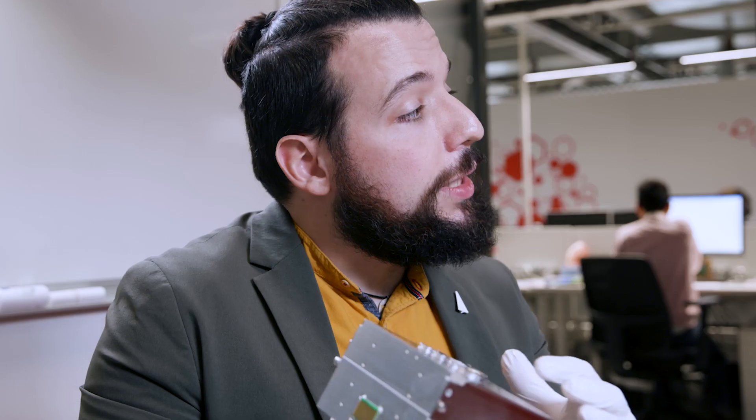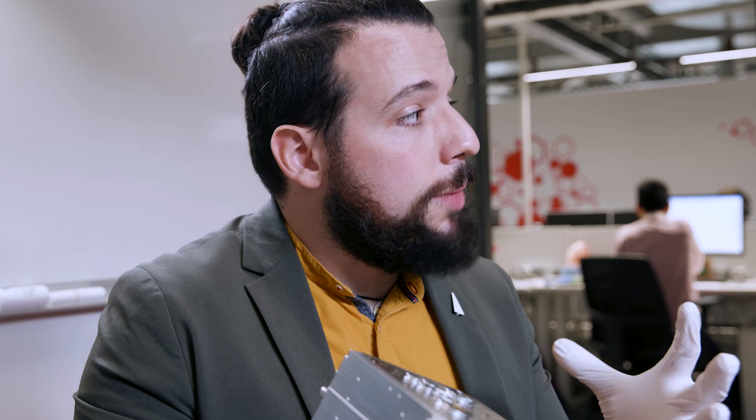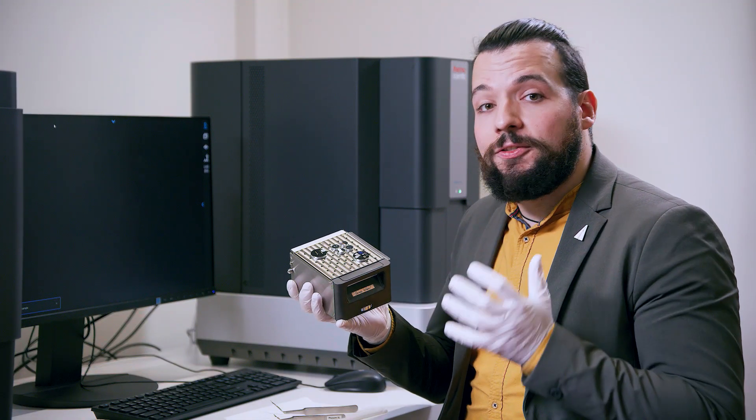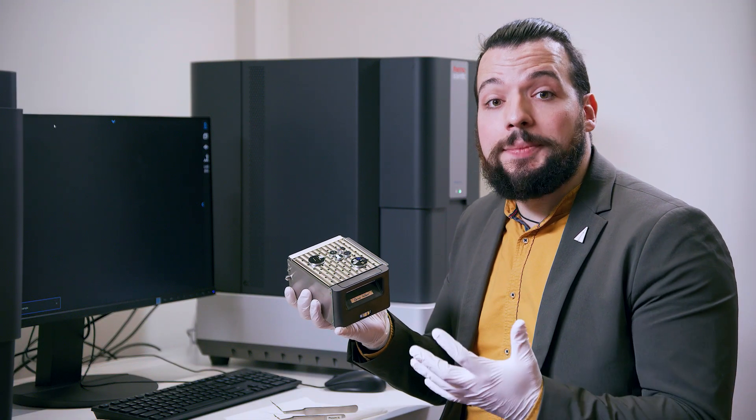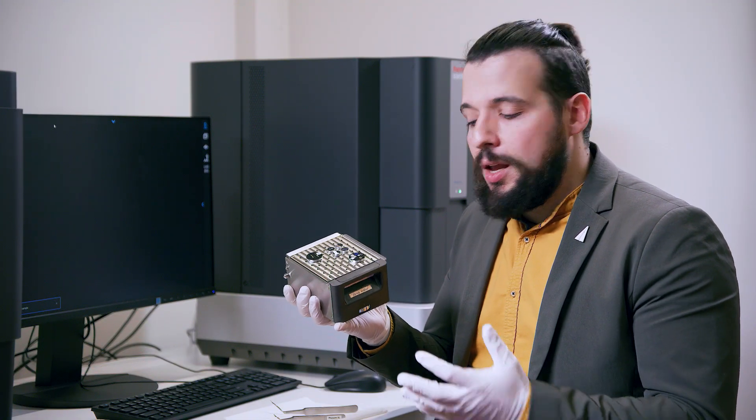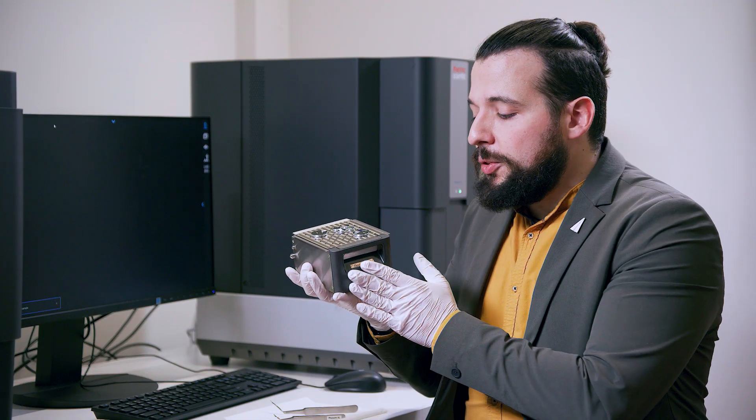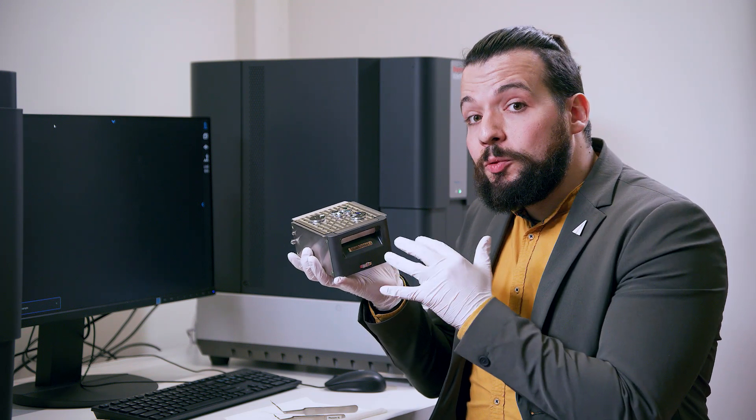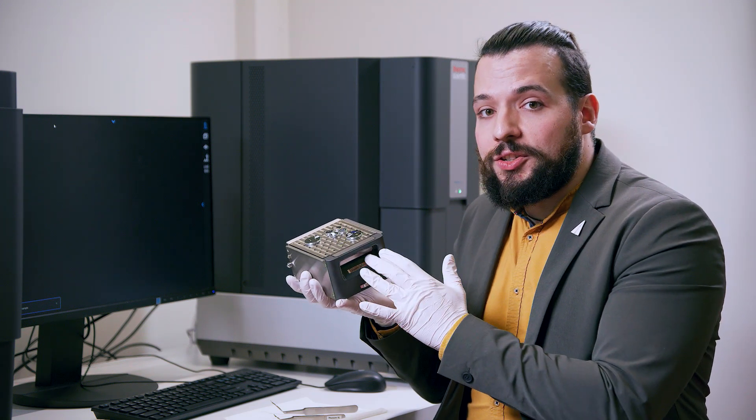The 10x10cm sample holder allows you to load a very big sample or 36 different samples at the same time. The sample holder stage can be lowered by up to 4cm.